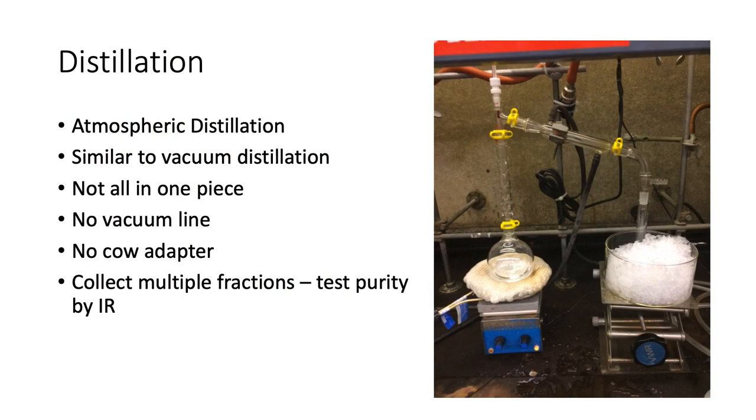So you want to make sure that everything is clamped and secure before you start distilling, because if you have gaps in your glassware and then you start heating and your product becomes a gas, you will lose it all. The distillation will purify your product from any remaining insoluble impurities or higher boiling impurities that we do not want in our final product.